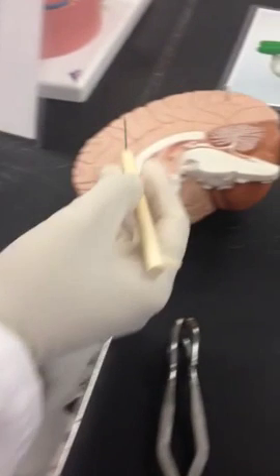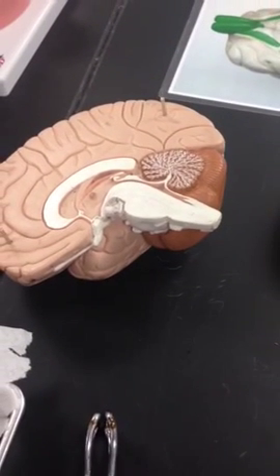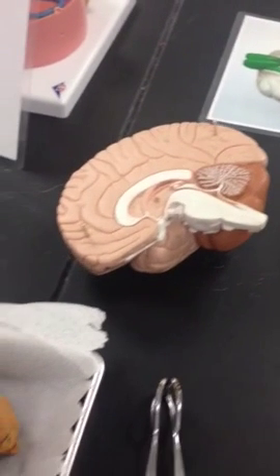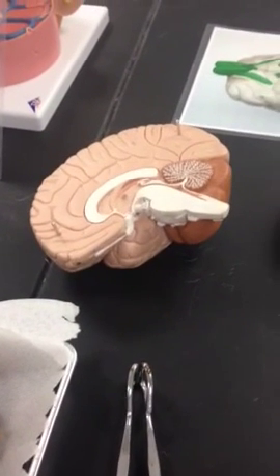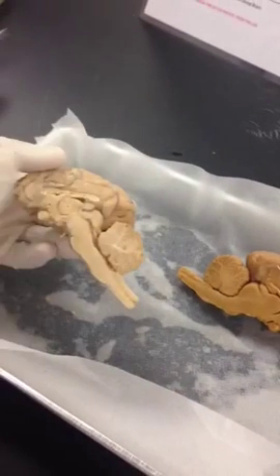In the models you can see, can you see the model here? You see this little dot? That's your intermediate mass. That's where both the thalami from the left and the right connect. And also your corpus callosum connects the right and left hemispheres.